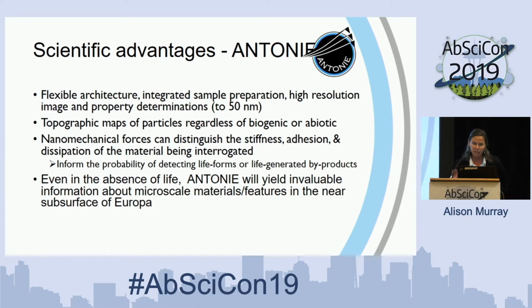The advantages of ANTONIE then are that this system, as we've designed it, has flexible architecture. We can partner with other instruments. Its integrated sample preparation system affords us high resolution image and property determinations. The topographic maps will be useful information regardless of whether the particles are biogenic or abiotic in nature. And the nanomechanical forces can potentially help us inform between life forms and those that are not life in terms of stiffness, adhesion, dissipation of energy.